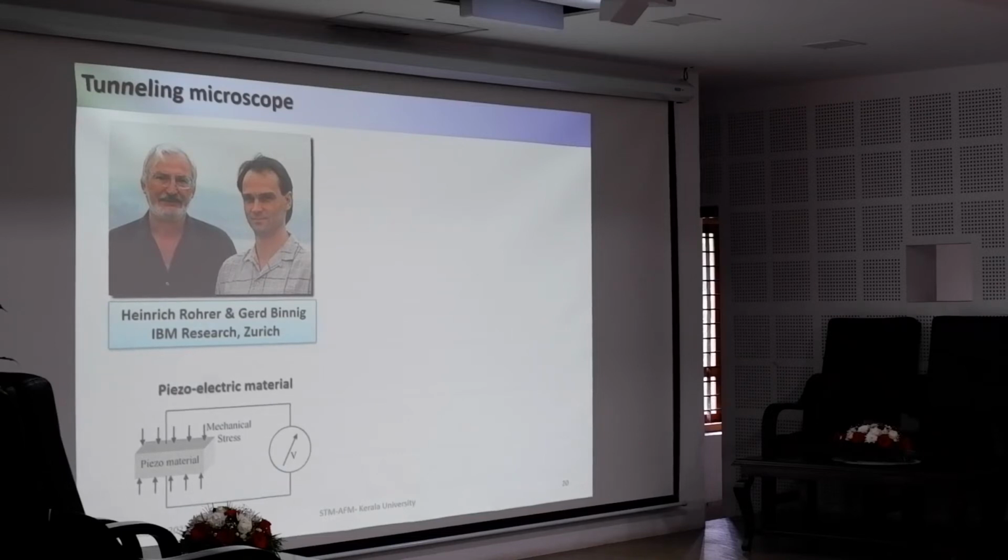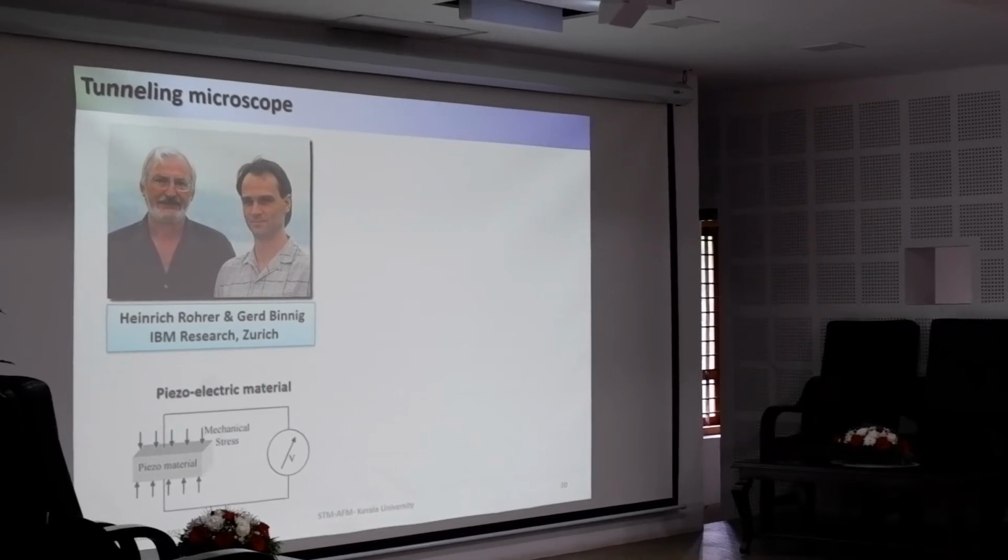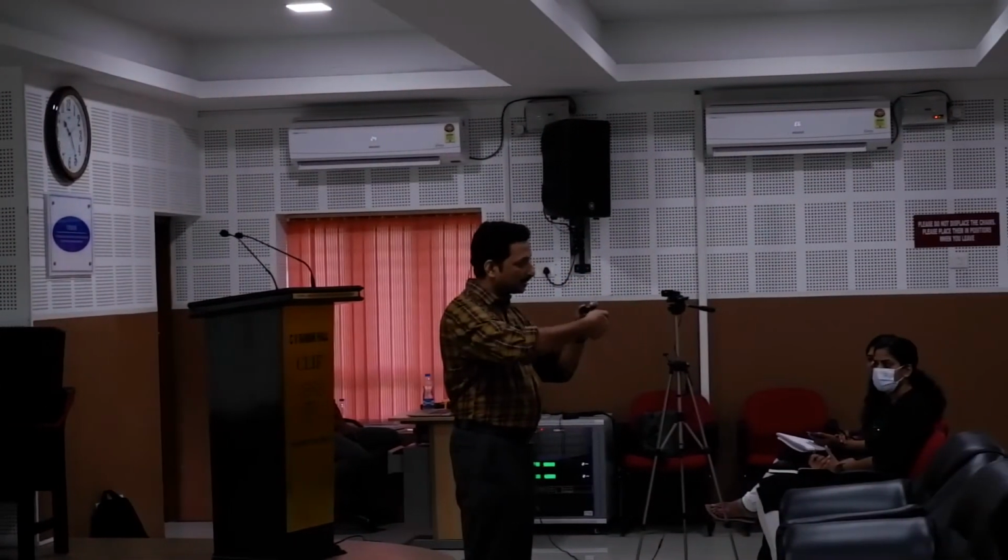The advantage of a piezoelectric material is that, suppose this is a piezoelectric material, if I apply voltage across it, it will expand or it will shrink. That is called piezoelectricity, right? Or the other way around also: if I press it, on the perpendicular side, voltage will develop. So they use it the other way around.